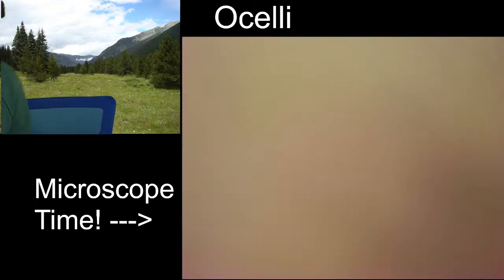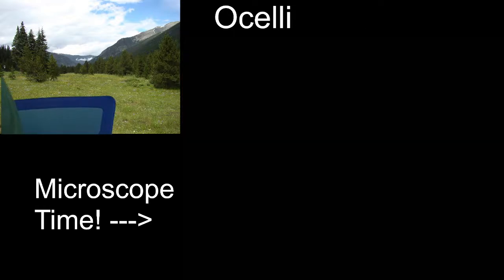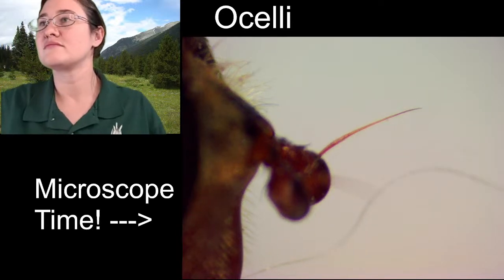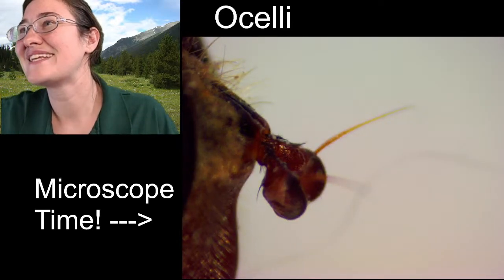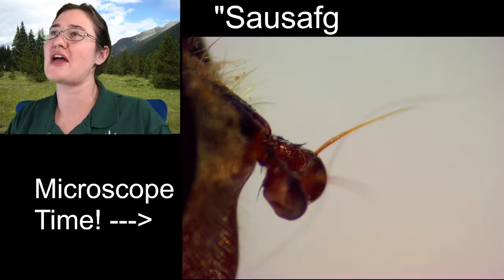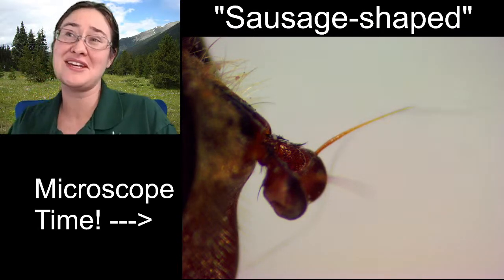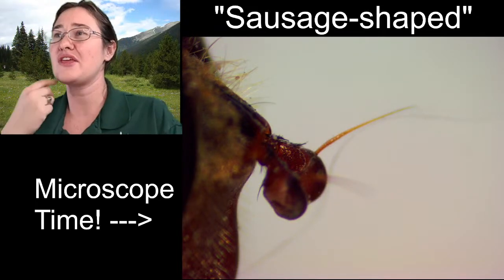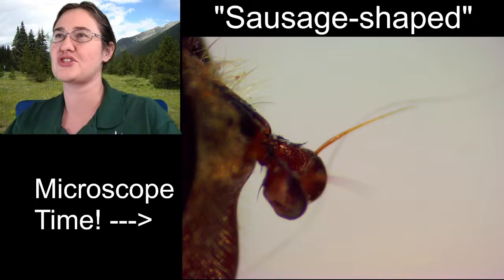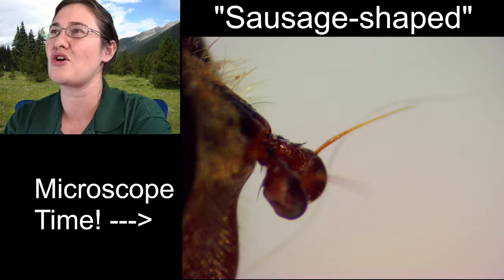Now I'm going to turn our specimen sideways so that we can see the antenna. So flies have really funky antenna. Sometimes people will call them sausage-shaped antenna. That's what I would consider a common name for them. They kind of are large. These guys are more rounded, so I don't see the sausage shape in these ones in particular. But a lot of times they look like big sausages that are hanging off their face. They're kind of wide and short. And these, you can kind of see they're almost like one segment.